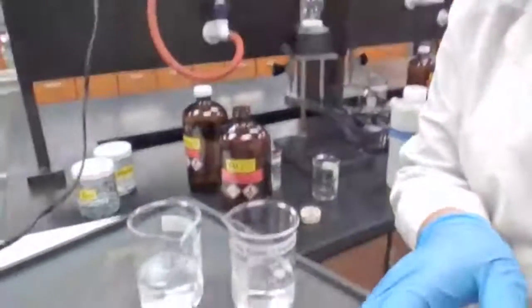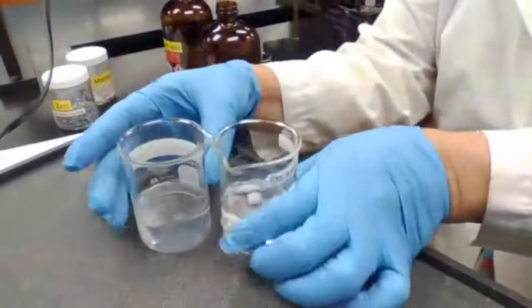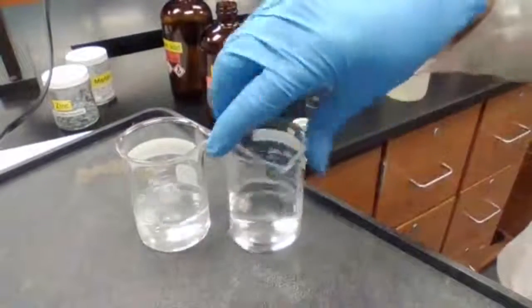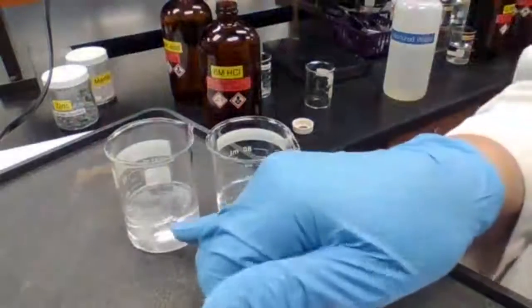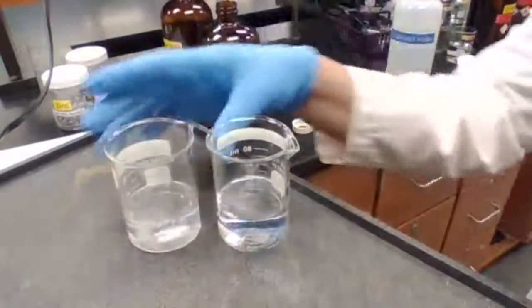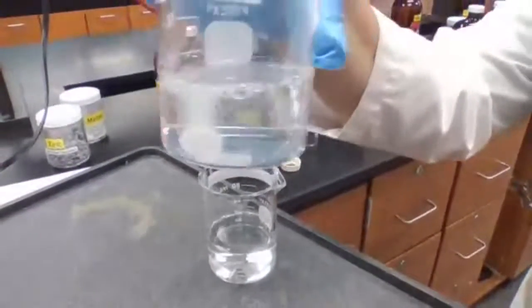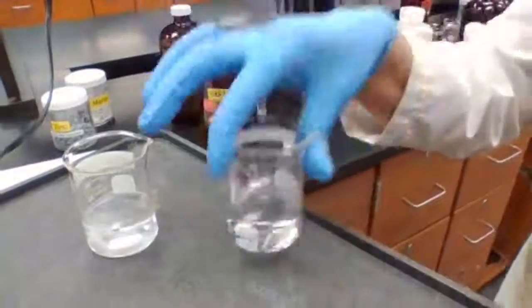Since we keep saying weak and strong, I want you to see what is happening. For the weak acid, acetic acid, we have no bubbles, and for the strong acid, it generates lots of bubbles, which means that lots of activity is going on there. That's the strong acid, and this is the weak acid.